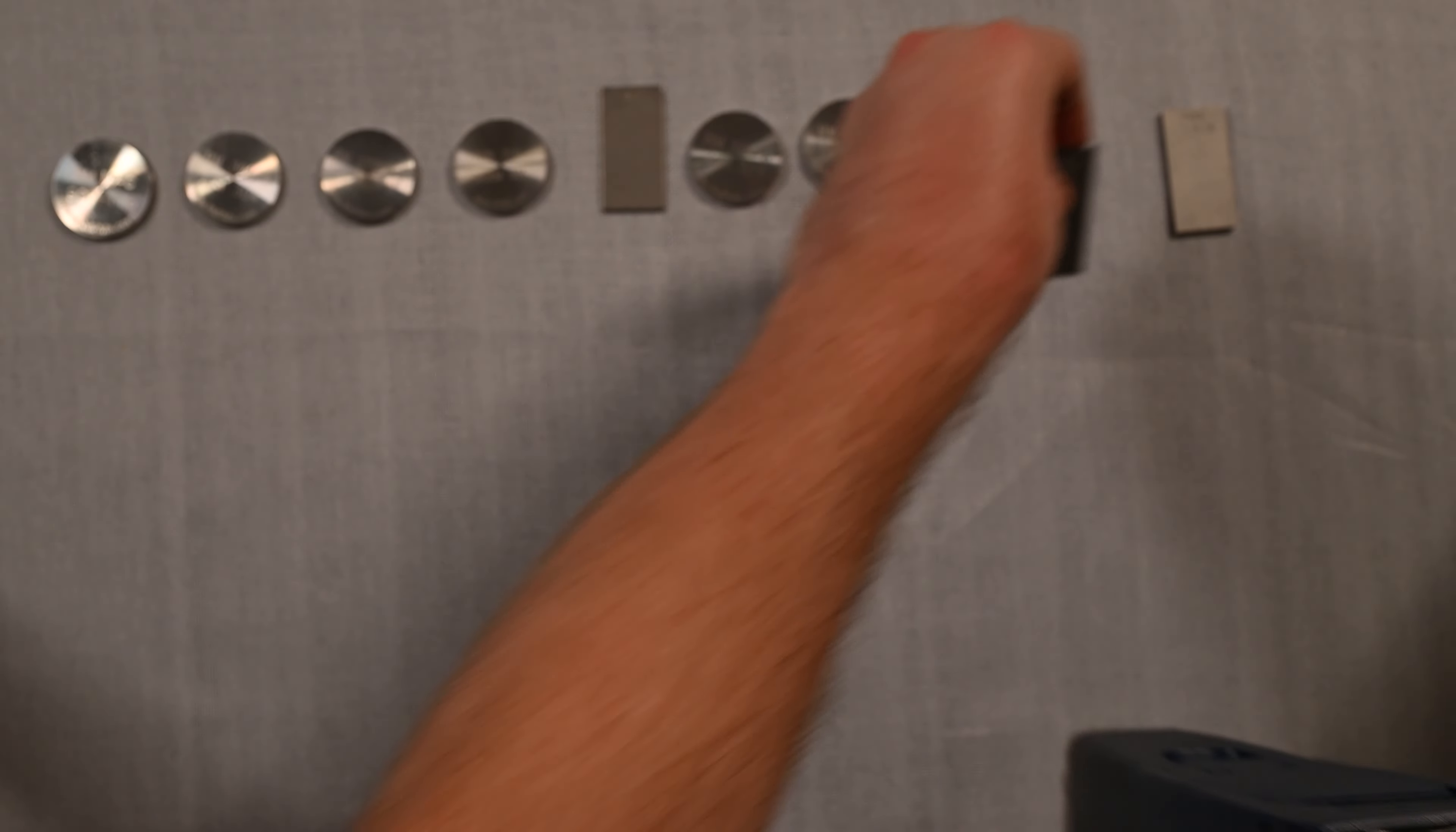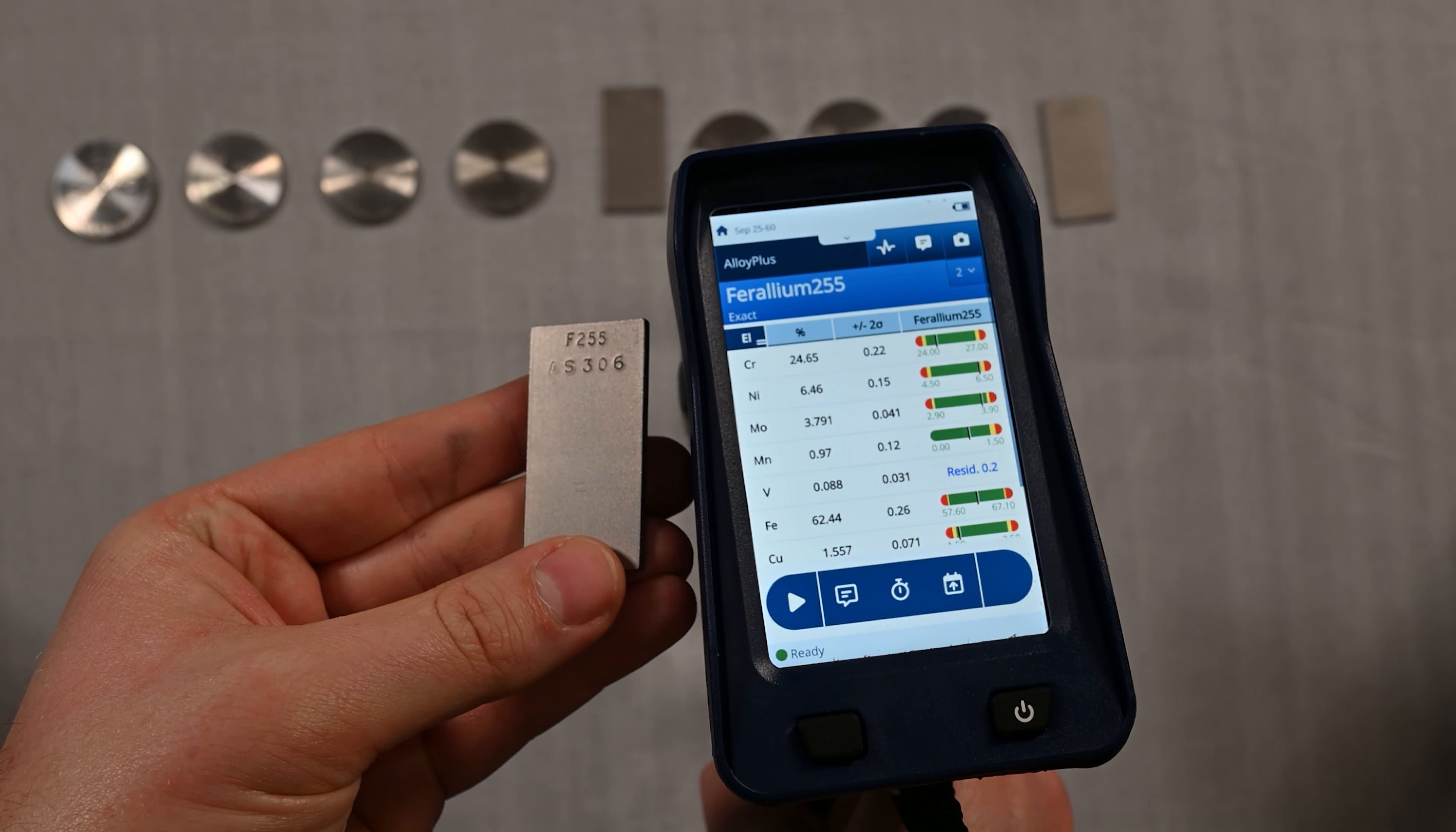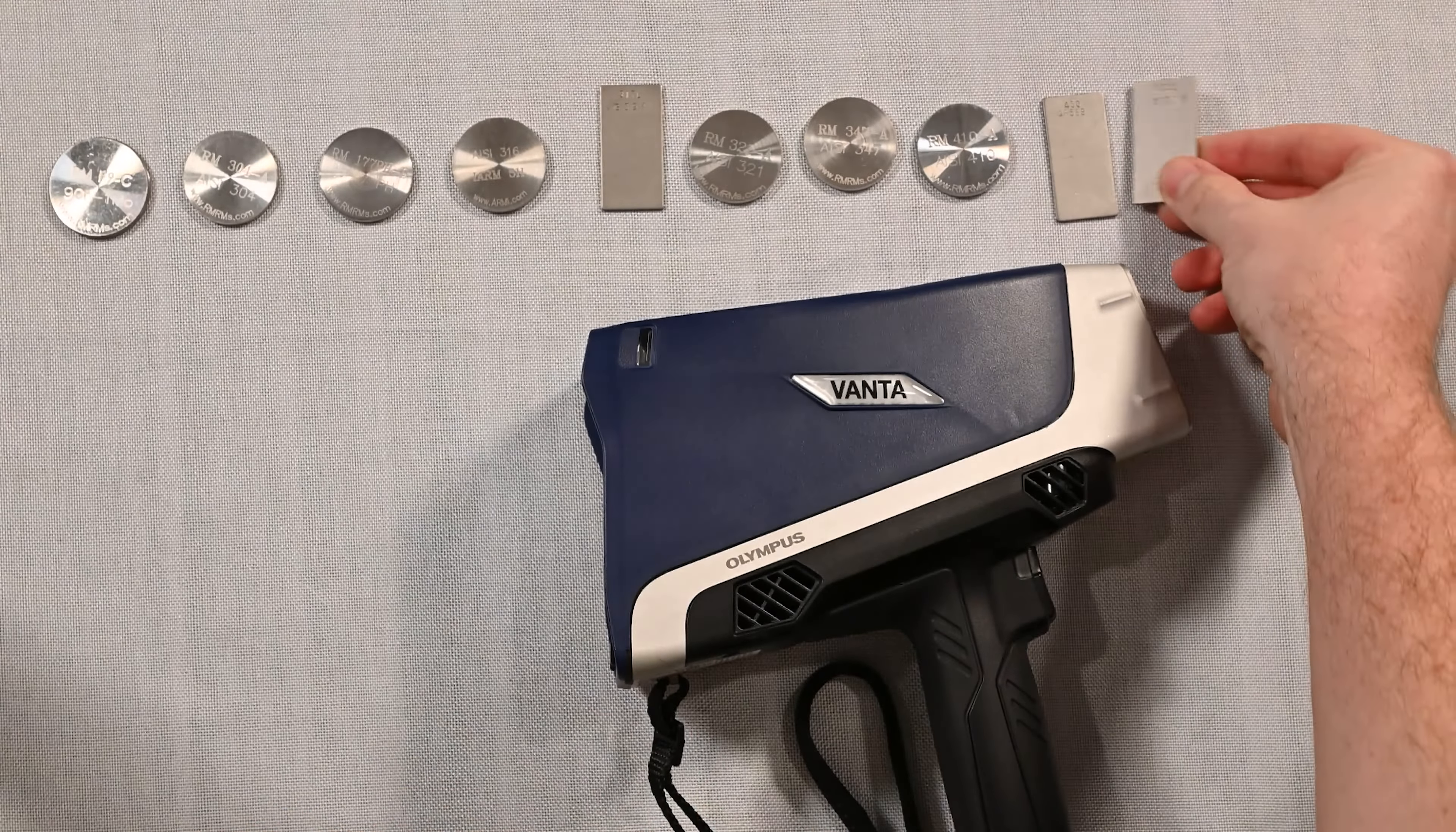Now here's a weird one. This is called F-255, but the trade name for this is Feralium. So we're going to see if this analyzer will identify this grade, and it will. You'll notice that there's a lot of... if you notice the chrome values, almost 25% chrome with a healthy amount of nickel at 6.46% and a ton of molly at 3.791%. So this is a very high alloy stainless steel, but again the Vanta Core did a great job and identified every stainless here.